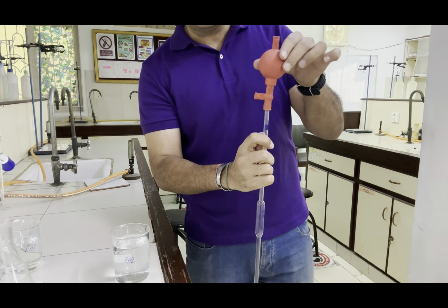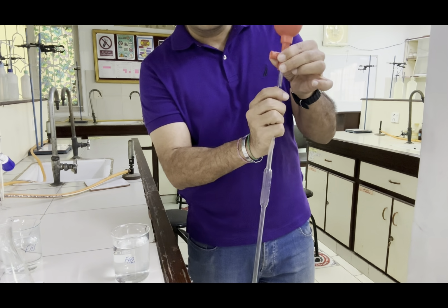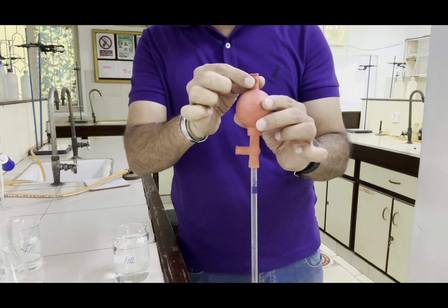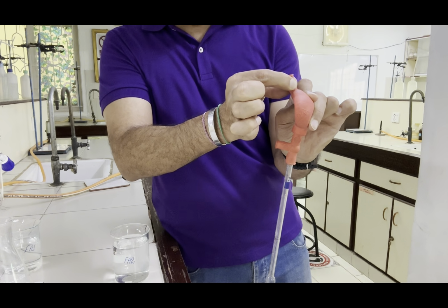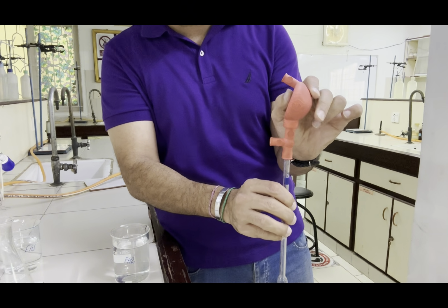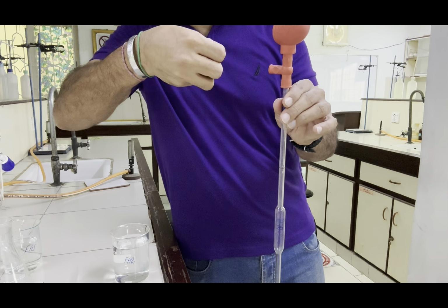We will make sure that we can use it with one hand and it will not fall. It's tight enough. Now, we will press this A button and we will squeeze this bulb. Now we will release this A button and the bulb will remain deflated. Now it can suck the solution up.